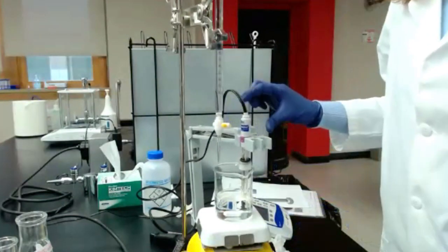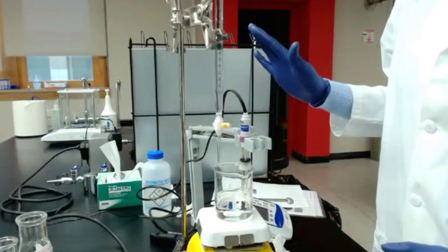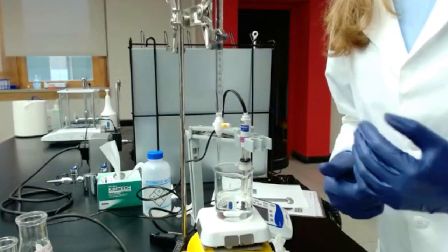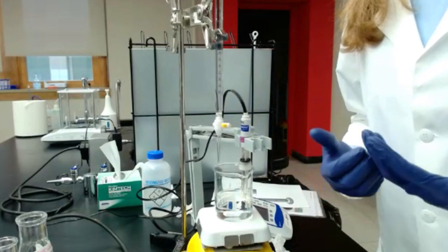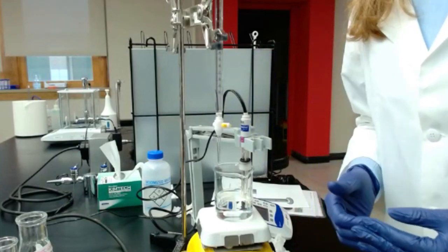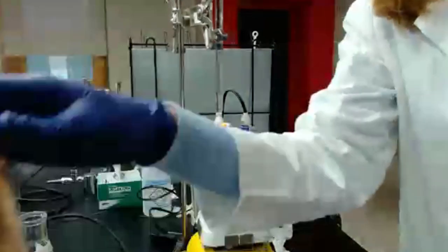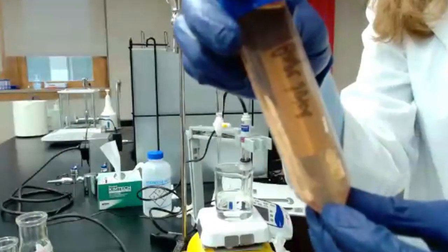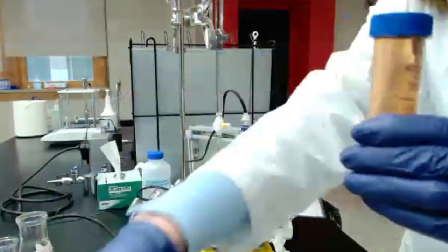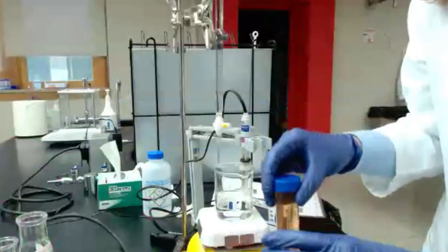All right, so once you have the correct pH, you're going to add the juice, because we want to evaluate how much titratable acidity we have in the juice. To do so, we take the juice we provided to you in a tube for ease of handling.